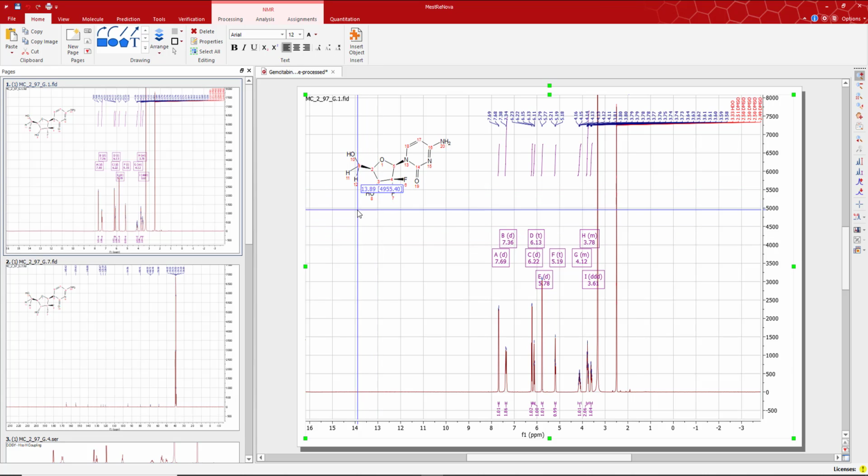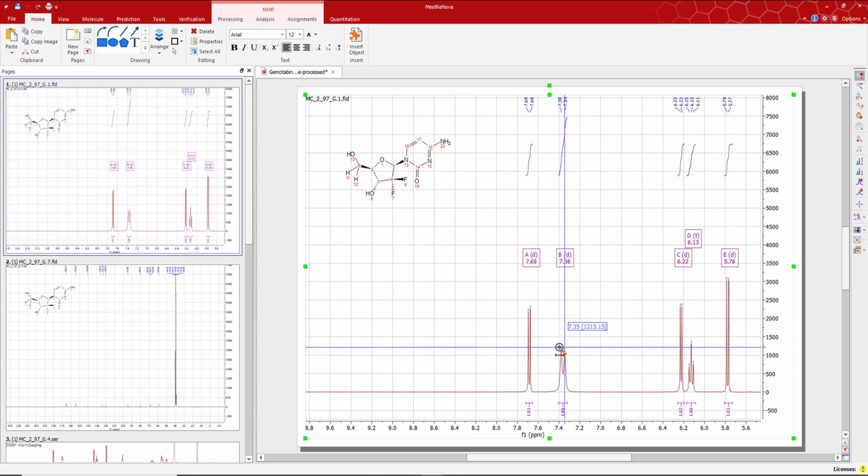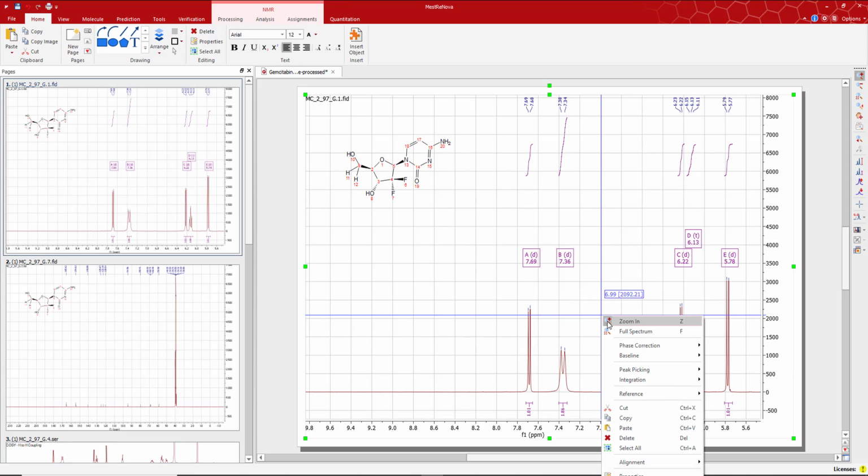I have 2 signals, proton 8 and proton 10 on the hydroxyls, that should be 1H's, and this signal here, the NH2, number 20, should be a 2H. And so right away that should tell me what the amine protons are. The only 2H signal I have that is a heteroatom is this set right here, and what's weird is that MestReNova is reporting that as a doublet.